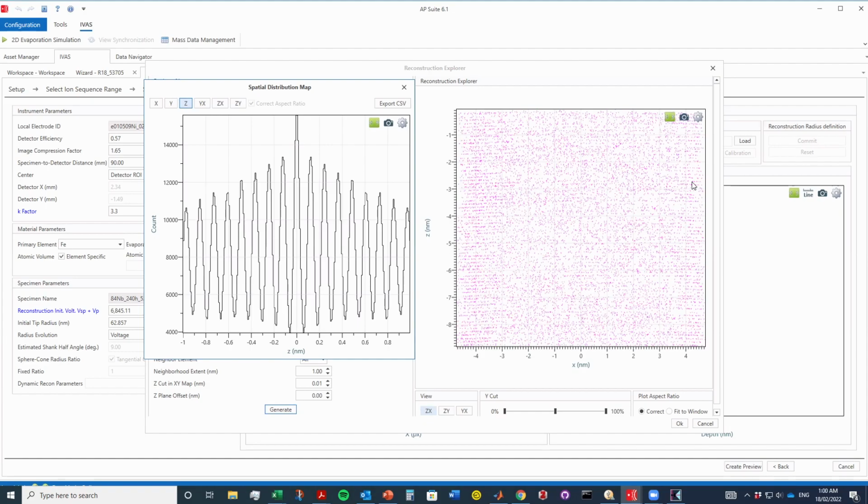I mean, it might differ a little bit. Or you all know Vegard's rule, for example. Yes, it might differ a little bit, but it's a fairly solid way to identify something you know. And the good thing about it is it's in the volume, so it's kind of everywhere.